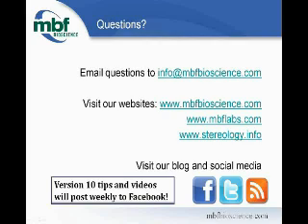That's how the UI is built, but there's nothing that limits our application from going to N channels. And in fact, we modified the JPEG 2000 file format to be able to hold more than 3 channels worth of image data. And so if you are going to acquire 4+ channels, you should save your image data as an MBF JPEG 2000, either as a JP2 or JPX, in order to retain that information.